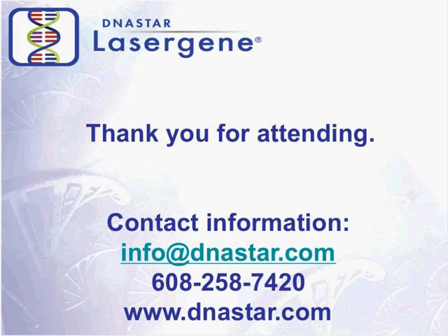Ian, you touched on the Assemblathon 1 in your presentation. One question came in: have any new assembly evaluation metrics not part of Assemblathon 1 been developed for Assemblathon 2 that are not dependent on knowing the correct assembly? Well, we're working on a few of those kinds of things, but they're experimental in nature, requiring experimental biology, things like optical maps. So it's not something where you just run some new program and it tells you if you got the right answer or not, but something where in a novel genome, you'll have to do some kind of sampling of something else to figure out what's correct or not. I mean, there's only so much you can do with software if you don't know what the answer is.